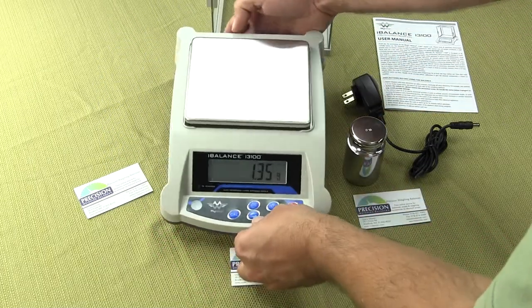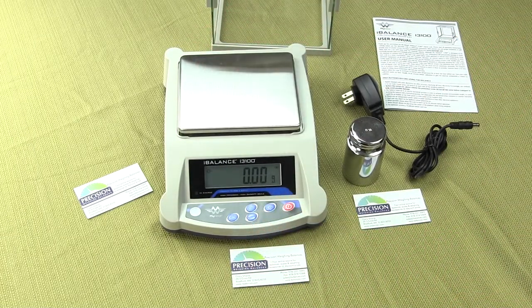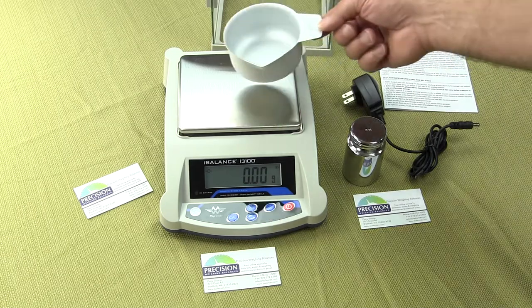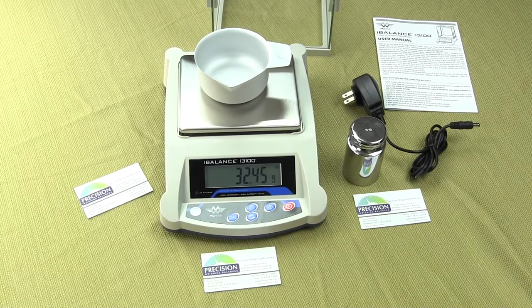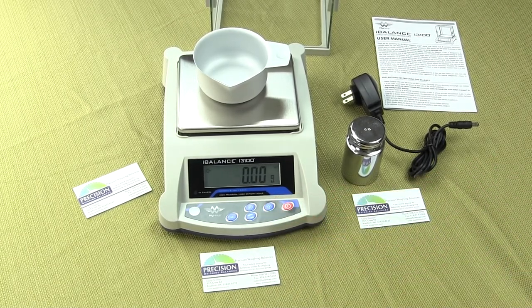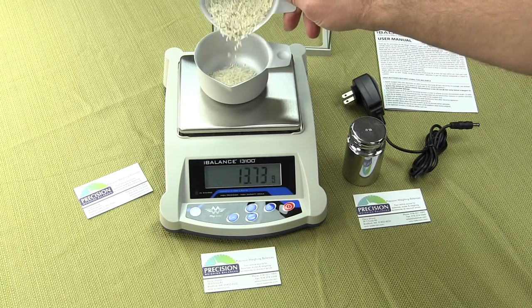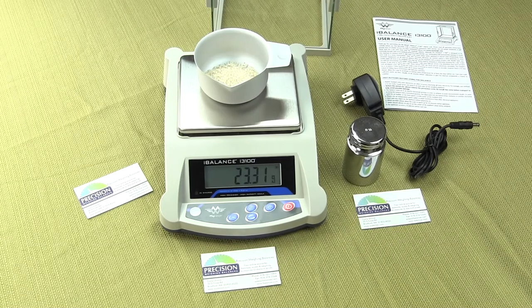We are Precision Weighing Balances — you can visit us at balances.com or scaleman.com. You do have the ability to tare, so if you place a cup on the scale you can simply press the tare key to zero it out, then add whatever you want on the platform. The response time of the scale is pretty quick — it's a great value for this price range.